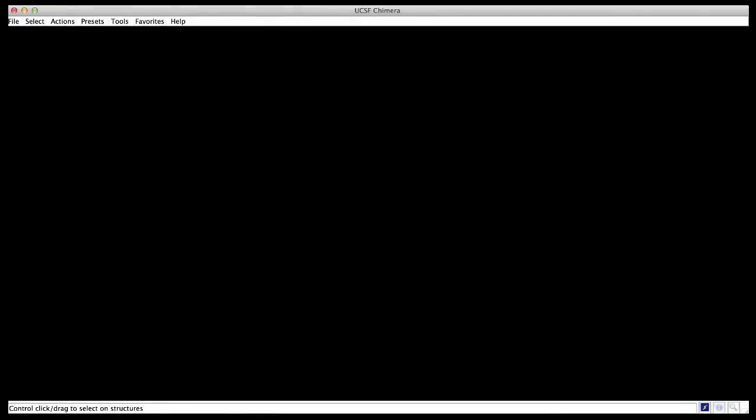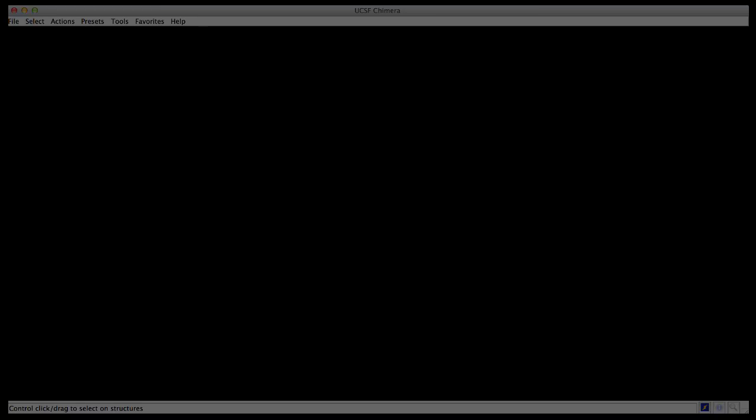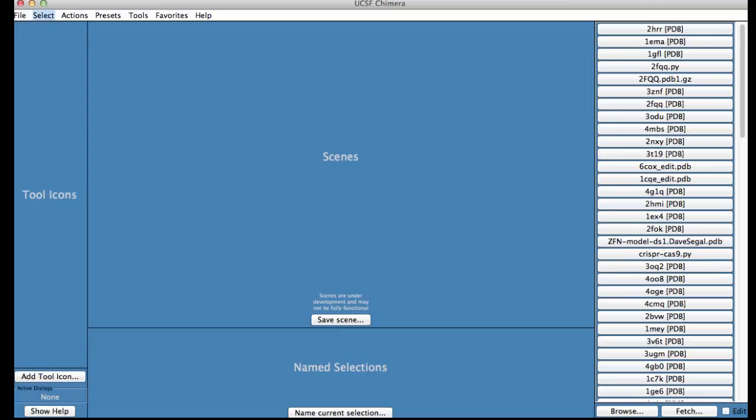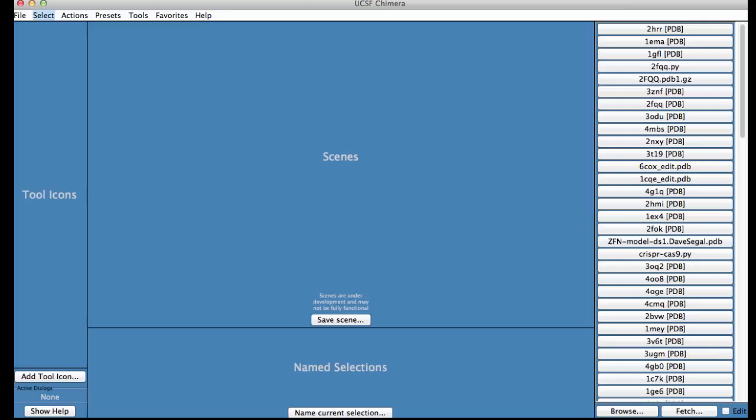When you open UCSF Chimera for the first time, you will see a black graphics window with menus on the top. Each subsequent time you open the software you will see a blue screen and a history of files visualized on your computer before. You can click on any of these file names to launch a session and visualize that structure.